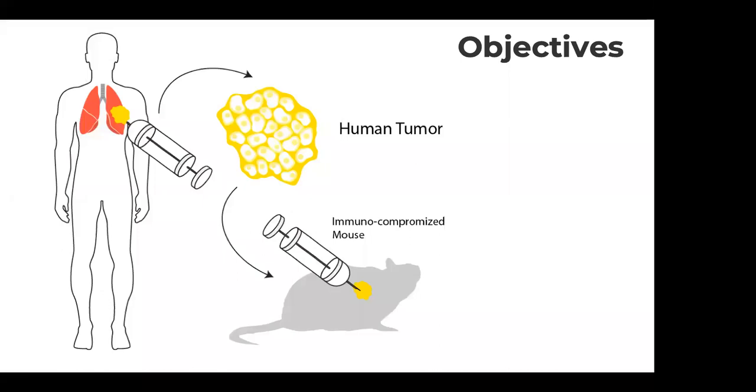Another objective of doing this is to find genes associated with functional processes, typically through breast cancer subtypes. So the breast cancer subtypes that we described, we are trying to find genes associated with them. So let's see how we can practically see the various aspects of the RNA-seq pipeline using the data set.